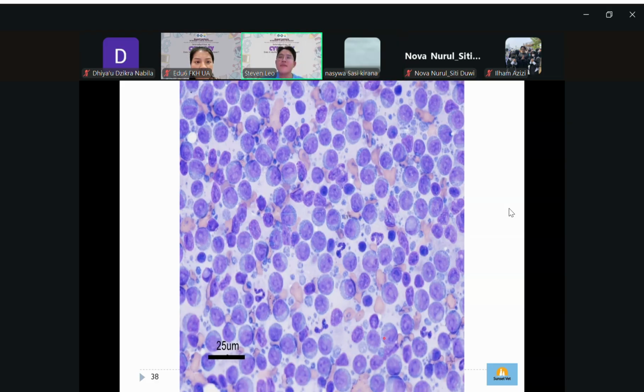Yes. And histiocytic, no, histiocytic cells don't have any granules. Mast cell and then melanoma. And how about the vacuole? What cells do you think from the round cells? Lymphoma. No, it's TVT.